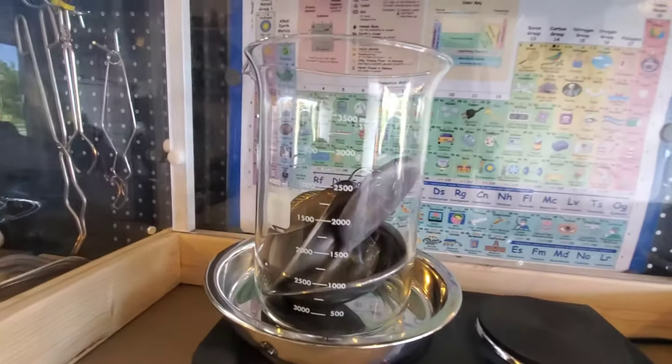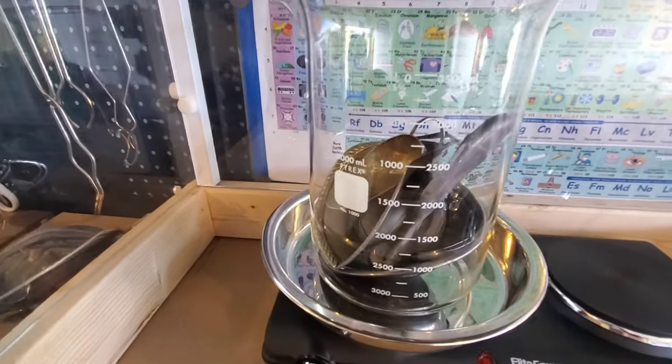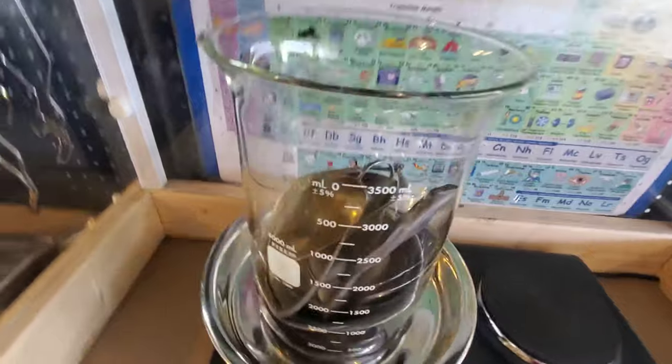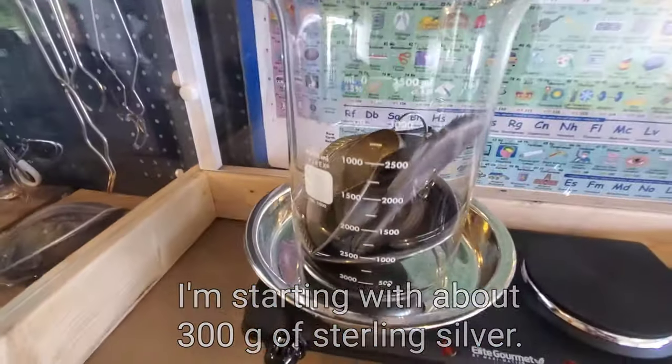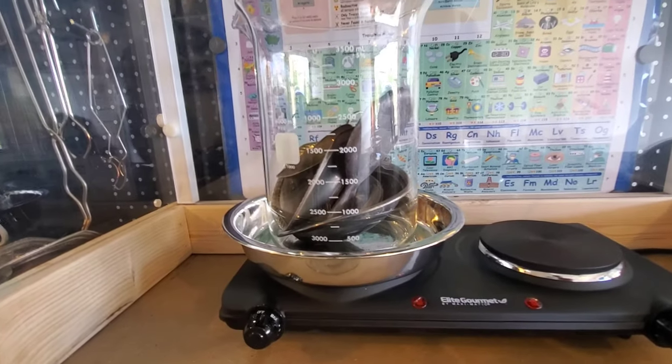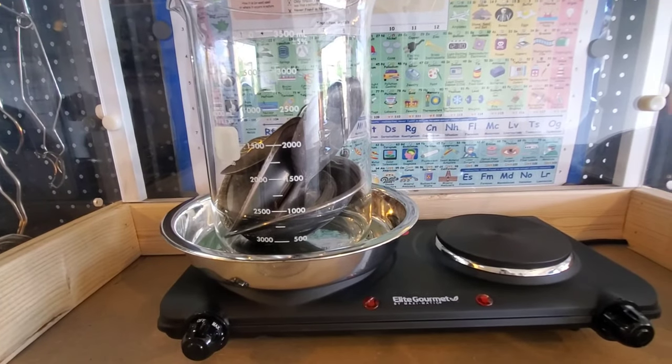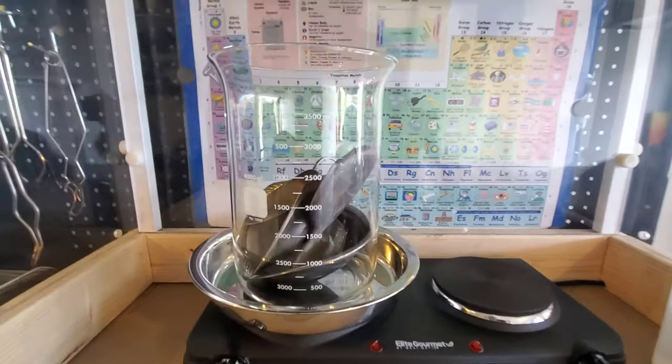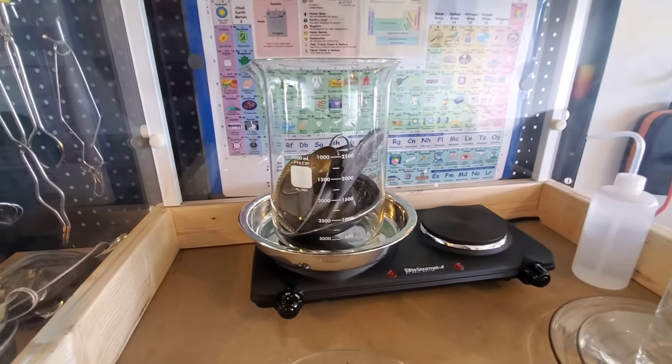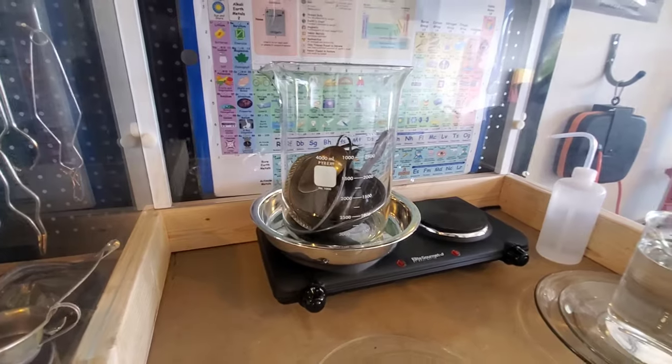Here you can see I have some of the sterling silver that I'm starting off with in the beaker here. And then in a second I'm just going to add some distilled water along with some nitric acid which will start the reaction in the refining process.